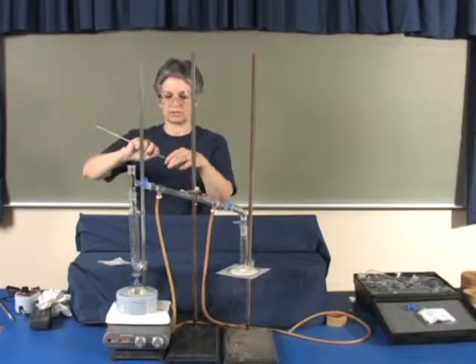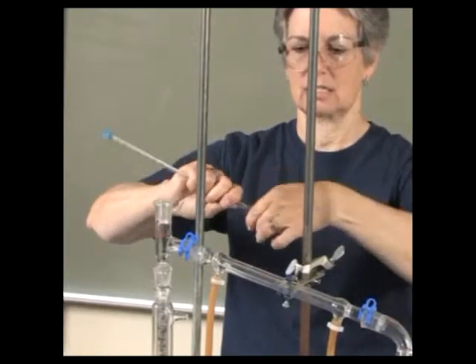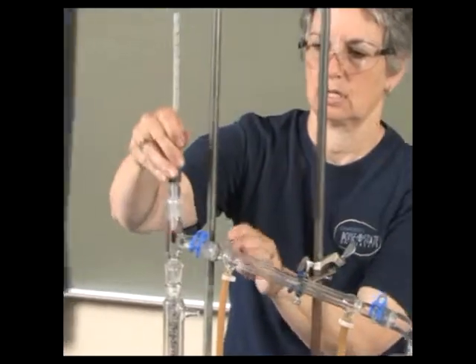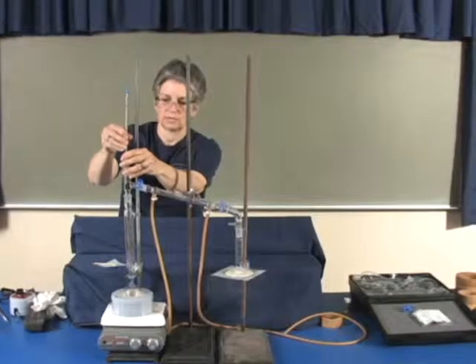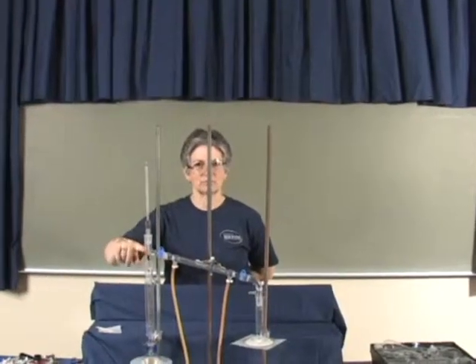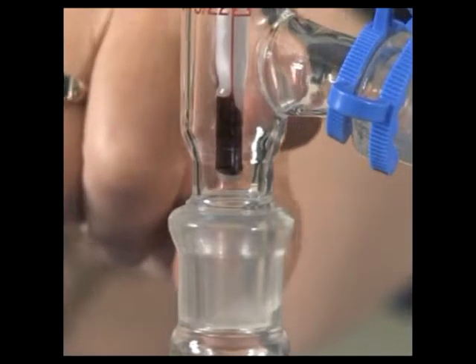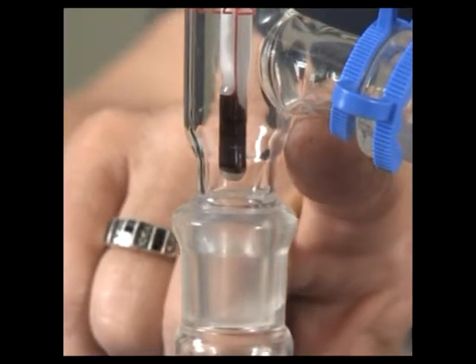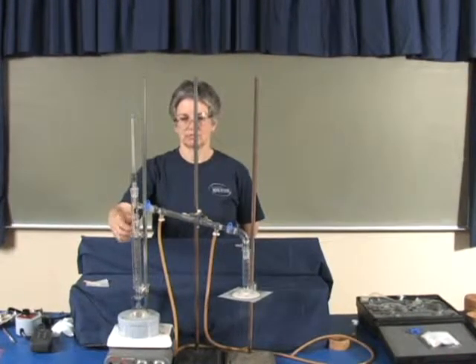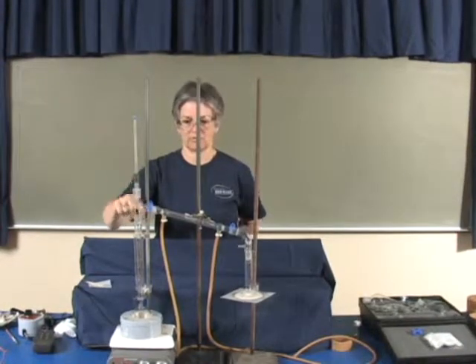holding close to the tip of the thermometer. As you insert it, twist it as you push, and then continuing to twist until it's in the right place. The placement of the thermometer is really critical to get good temperature readings. The top of the bulb on the thermometer should be at the base of the sidearm. If it's not in the correct position, you will either be reading temperature of vapors that are not coming over, or if you're too high, you will miss the temperature of the vapors coming over.